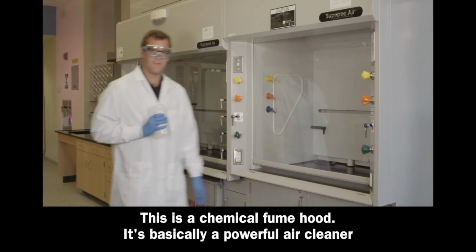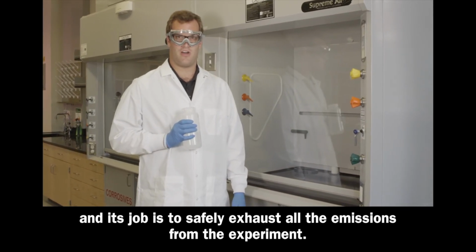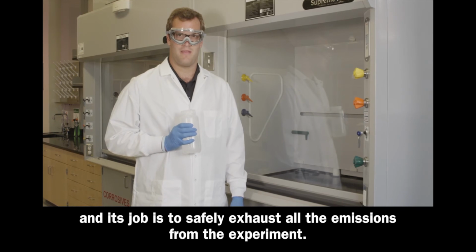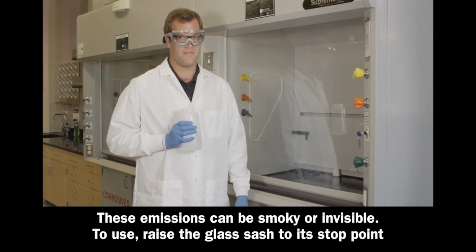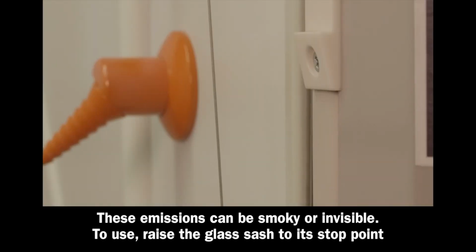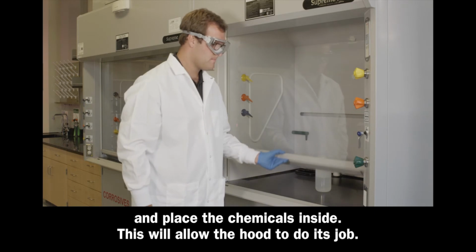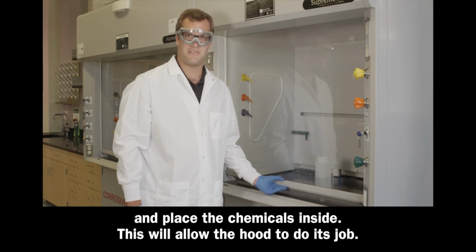This is a chemical fume hood. It's basically a powerful air cleaner, and its job is to safely exhaust all of the emissions from the experiment. These emissions can be smoky or invisible. To use, raise a glass sash to its stop point and place the chemicals inside. This will allow the hood to do its job.